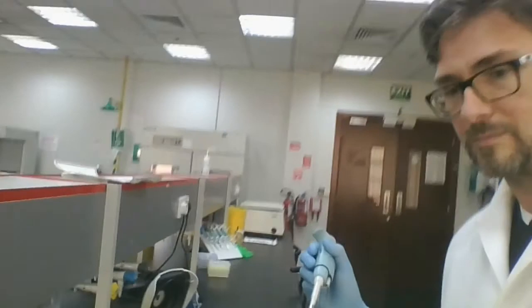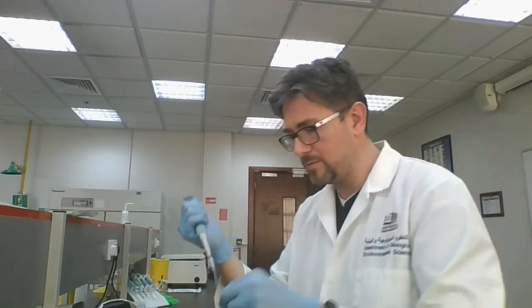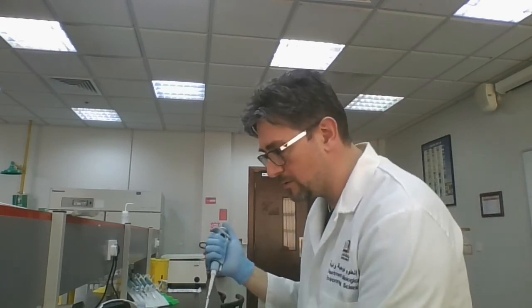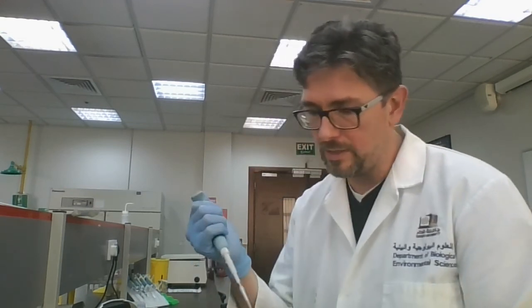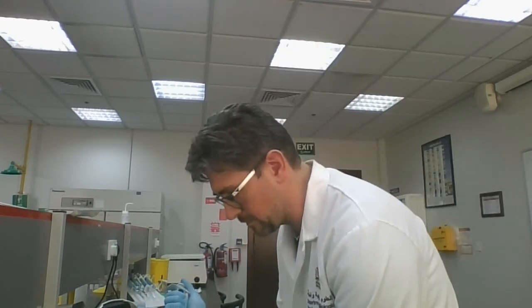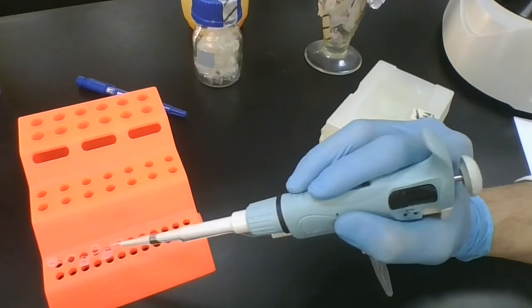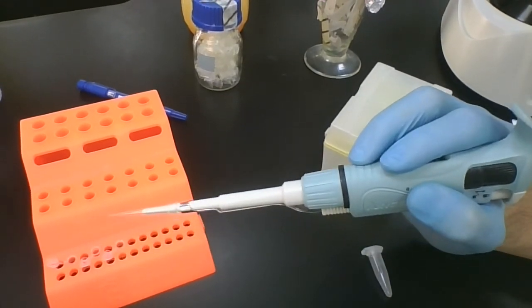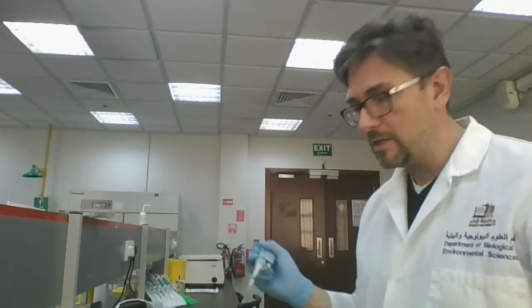Finish adding reverse primer to the second and third tubes, moving each one over after each addition. Once all tubes are on the same side of the rack, you've finished that component. The last component to add is the enzyme — Taq polymerase. Once that's done, we're ready to put our samples into the PCR thermocycler.